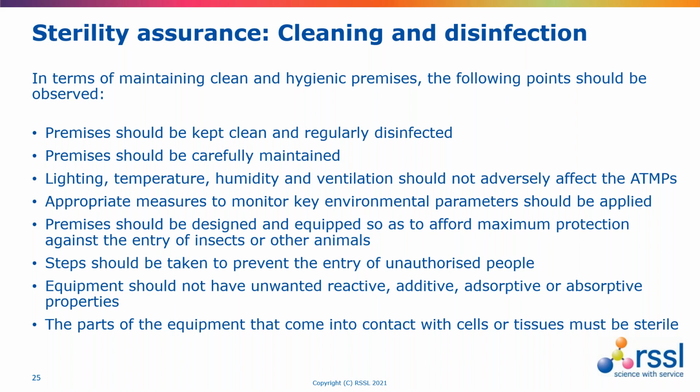that the premises have all the measures in place to avoid against the entry of pests, particularly things like insects, that there's nothing toxic manufactured or used anywhere near the processing areas, so a complete avoidance of any pesticides or herbicides, and that anything that comes into contact with the product has been adequately assessed, that there's no reactive materials that might contaminate the cells or render anything non-sterile.